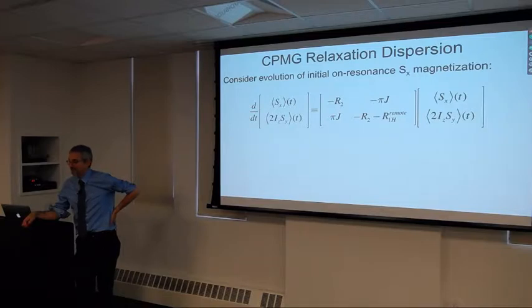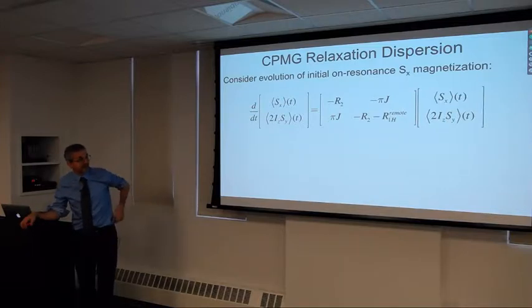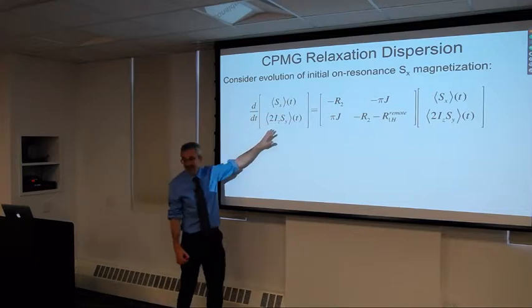And there's more of those than you usually think of. NMR people don't normally think about the serine hydroxyls, the threonine hydroxyls, the tyrosine hydroxyls, because you don't see them in the NMR spectrum. But they're there, and they're causing relaxation of any hydrogens that are around. So we can make the effect smaller, but we can't make it go away.